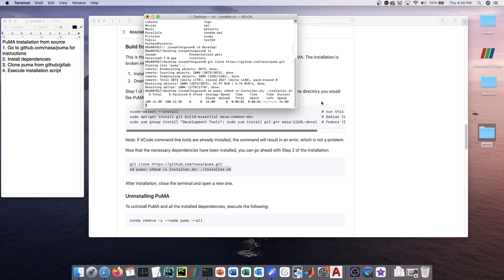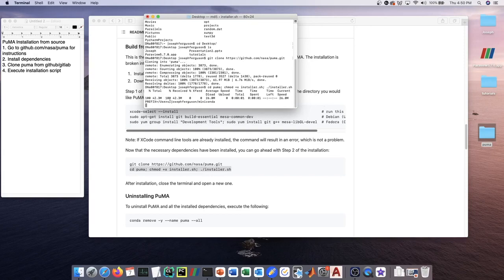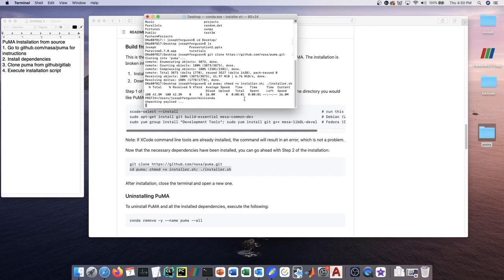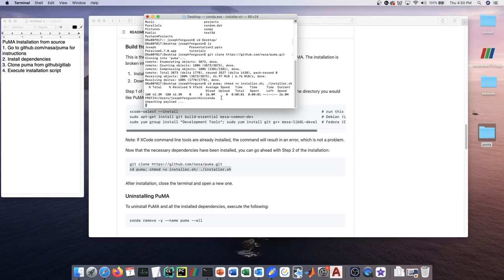You can see it's recognized that I don't have anaconda, so it's downloading the miniconda and it's going to install it just in my home directory under miniconda, which is the standard installation place for miniconda or anaconda.